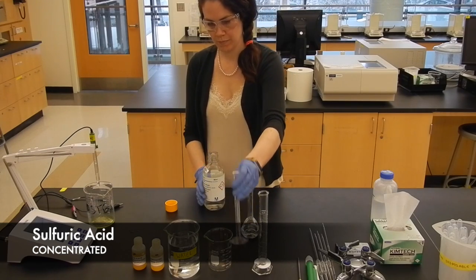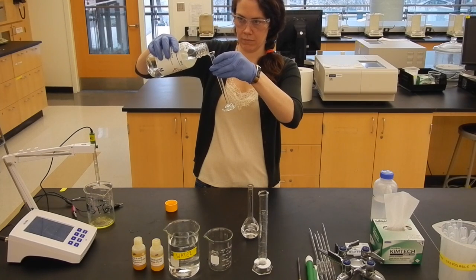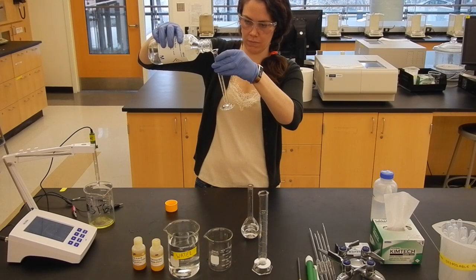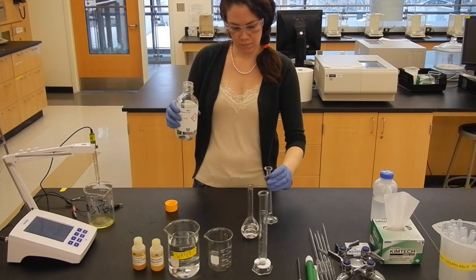To start, we need to make our reaction cell. As we need to know the exact concentration of each of our reagents throughout the experiment, we will use volumetric glassware to make our solutions.